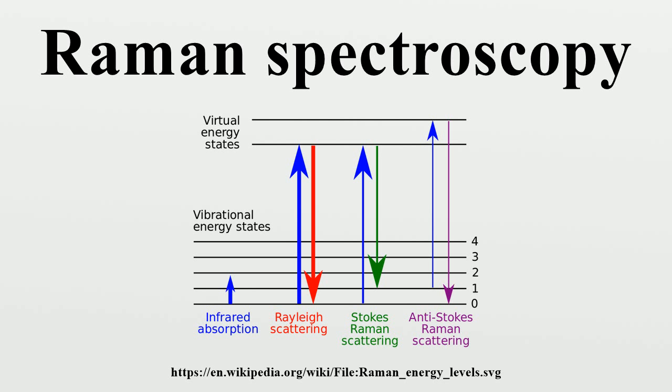Spontaneous Raman scattering is typically very weak, and as a result the main difficulty of Raman spectroscopy is separating the weak inelastically scattered light from the intense Rayleigh scattered laser light. Historically, Raman spectrometers used holographic gratings and multiple dispersion stages to achieve a high degree of laser rejection. In the past, photomultipliers were the detectors of choice for dispersive Raman setups, which resulted in long acquisition times.